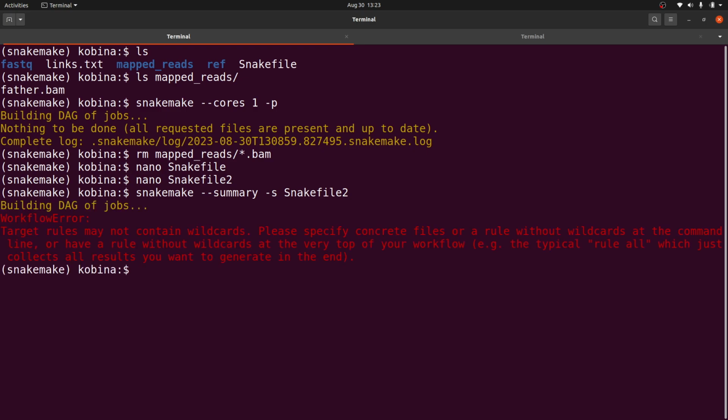All right. Now, if you execute it, you are going to see this happening. This is happening because Snakemake still does not get the information. The information here refers to the output. Behind the scenes, when you run Snakemake, it looks for the output and then the inputs, and then it sees if the output can be generated from the inputs. So it needs the inputs as well as the outputs, and it will just try to do the math. Let me just put it this way.